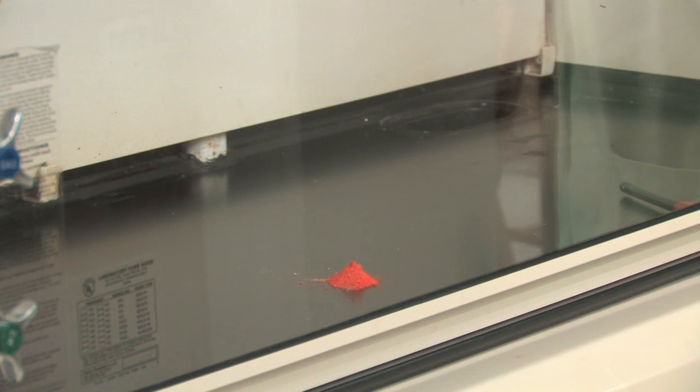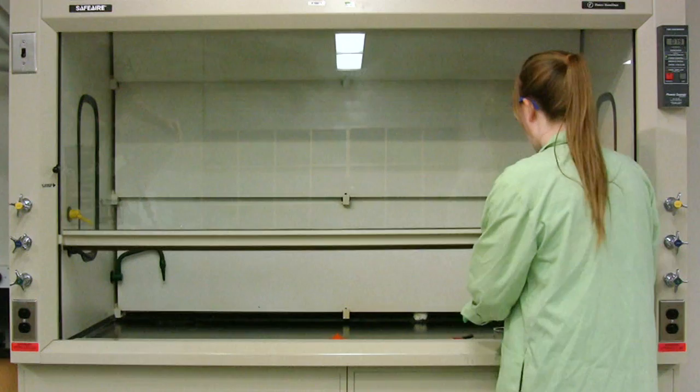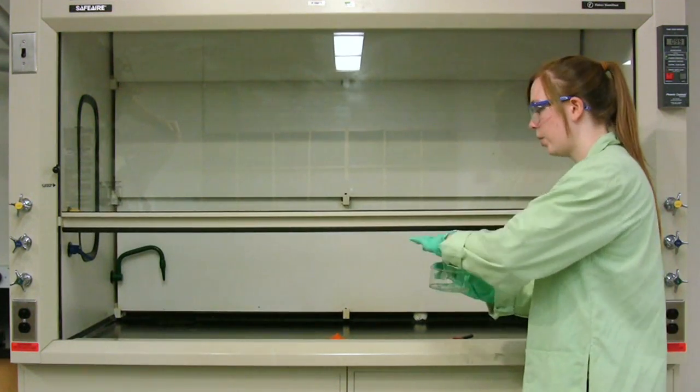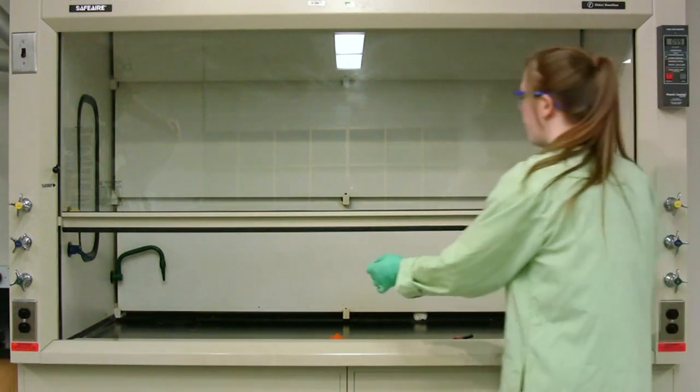So I have some ammonium dichromate here in the hood. It's an orange solid and I've piled it up to look somewhat like a volcano. I'm going to add this piece of paper that's been soaking in ethanol — this is going to be our fuse — and add it to our mound.